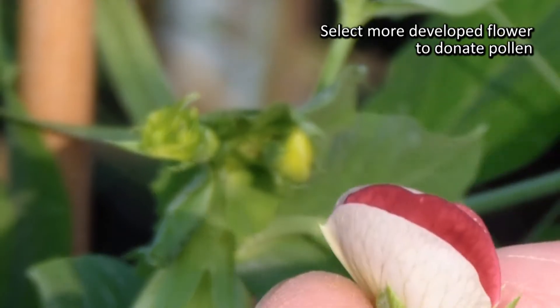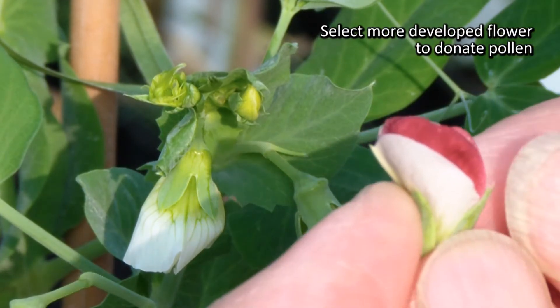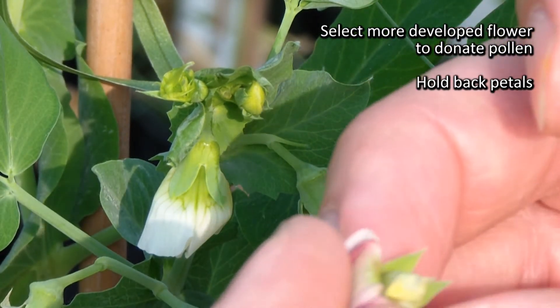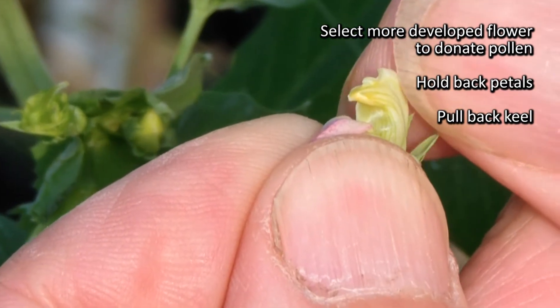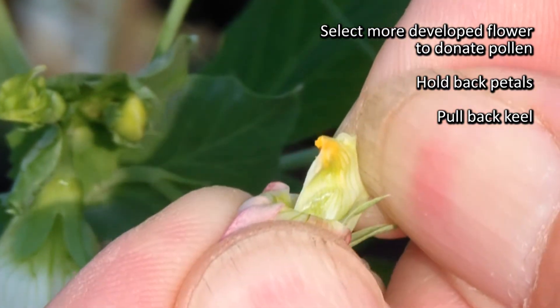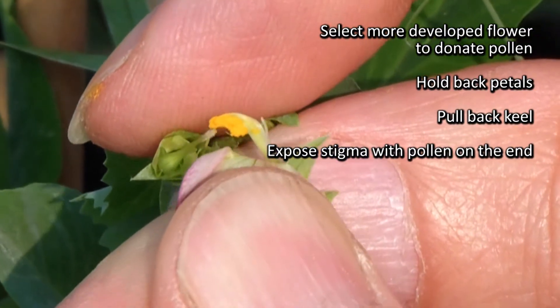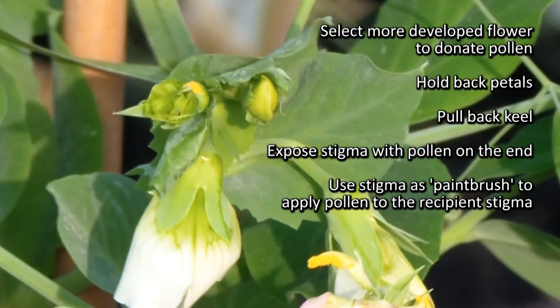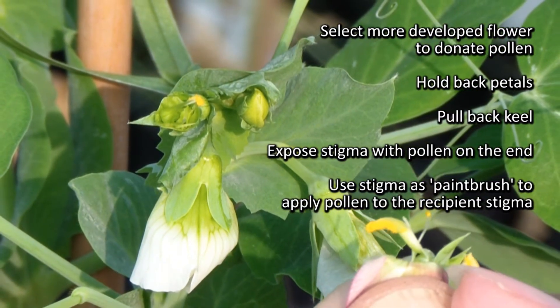Here's a flower that is just about to open — the anthers will have dehisced inside, so it's no use as a female flower. If you go in, pull back the outer standard and wings, hold those in one hand, then firmly pull the keel from the base to expose the style which is full of pollen. Act as a paintbrush and use that to apply the pollen. There's a large amount of pollen there — one flower at this stage will be enough to do several pollinations.